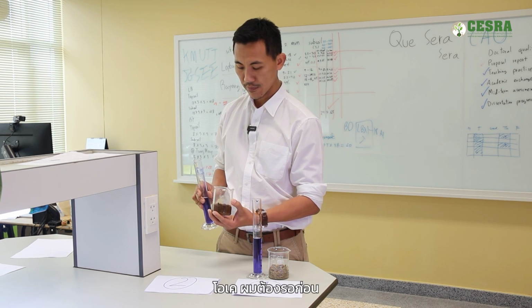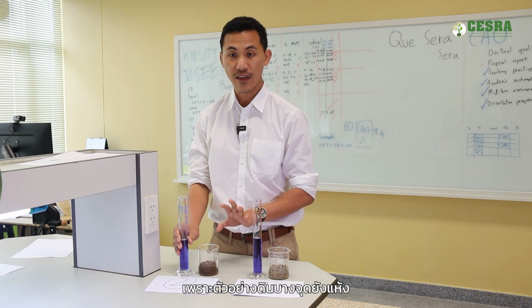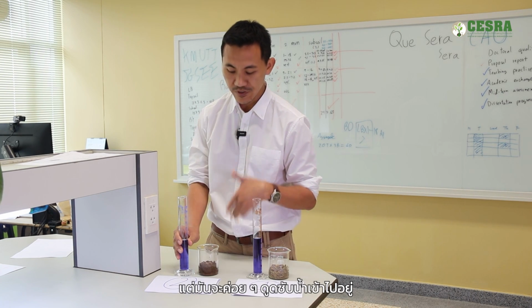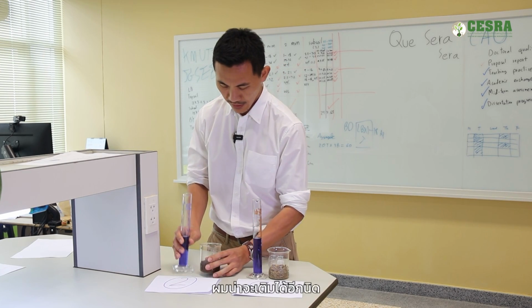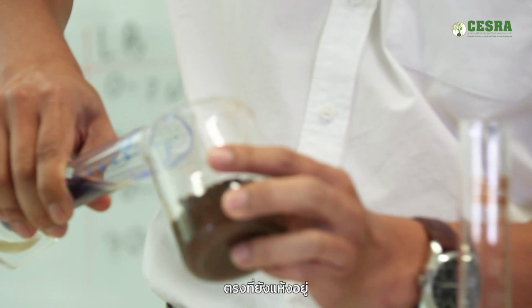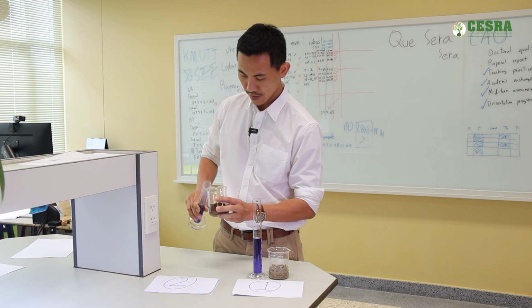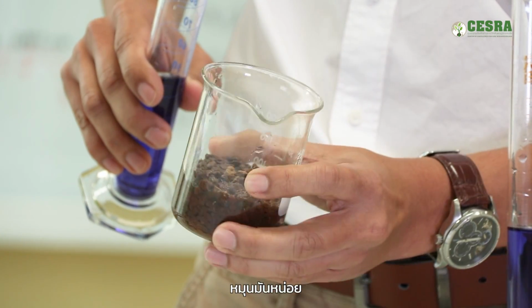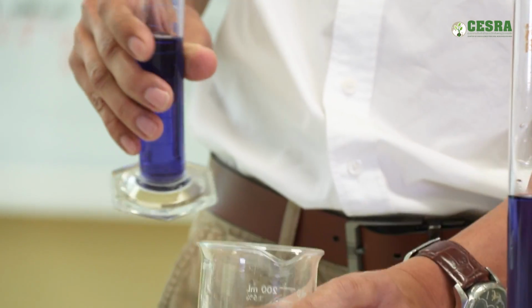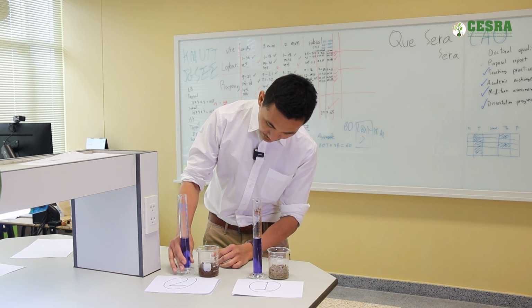Okay, I have to wait this time. Just wait a little bit, because we have just a few aggregates that are still dry, but they've started absorbing water. So just wait. Okay, I think I can add a little bit more, just to dry. And just turn it around a little bit. Okay, I think that's it for the second one. So now let's check.